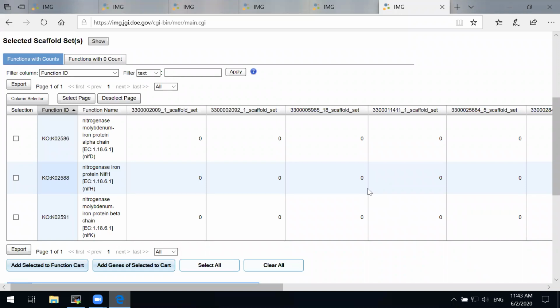First, it requires a little bit of explanation. We didn't find nitrogen fixation or nodulation genes. We actually didn't find nodulation genes in any of this high completeness set. Again, we were looking for bins with at least 98% completeness, right? These are high completeness bins, and we didn't find nodulation genes in any of them, and we found nitrogenase genes in very few of them. Why could that be? Well, there could be 2 explanations.